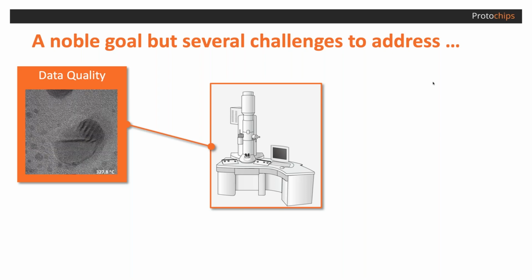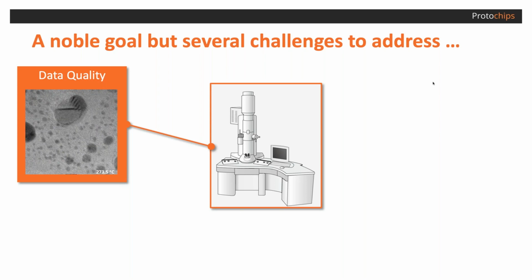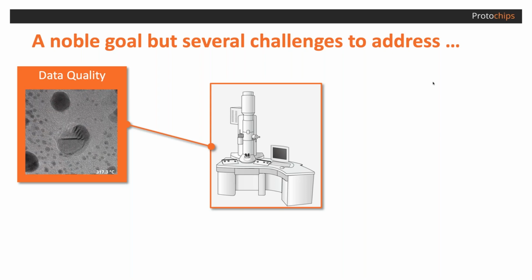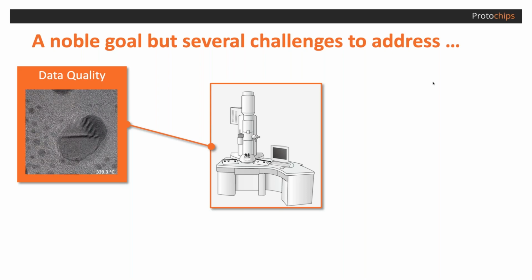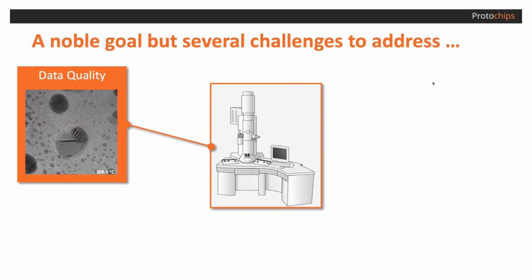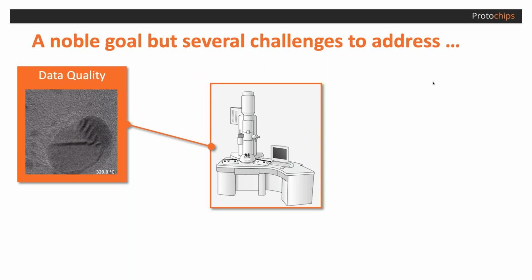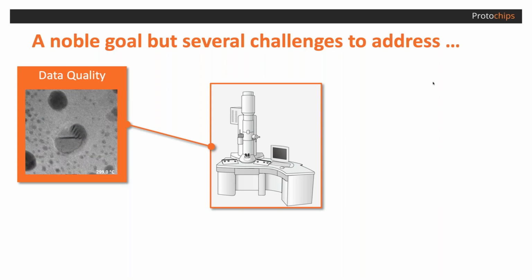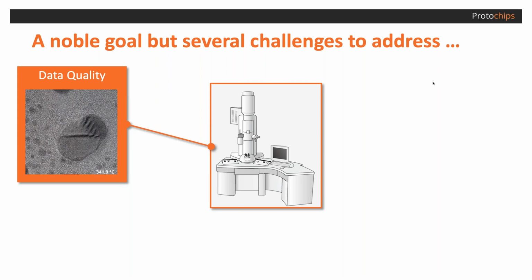Yes, of course, MEMS technologies made stability in in situ just orders of magnitude above where they were 10 years ago. But you still have to wait sometimes for things to settle. And then what you really want to do is to be able to change the environment as you wish, and have those images stay completely still so you can focus on actually what's happening with a specific particle or a region of interest. And that's just not possible today.